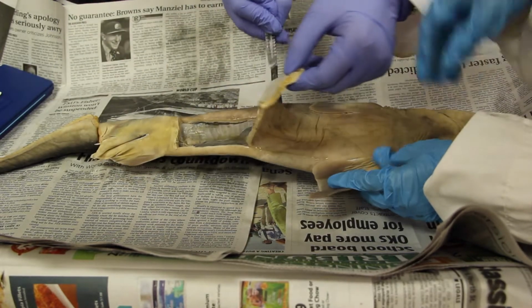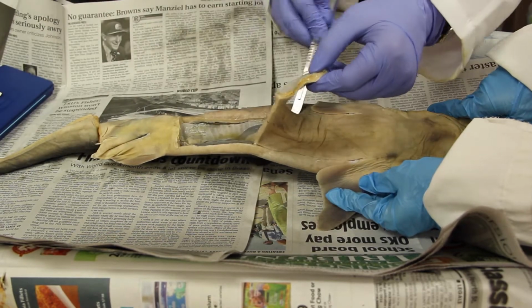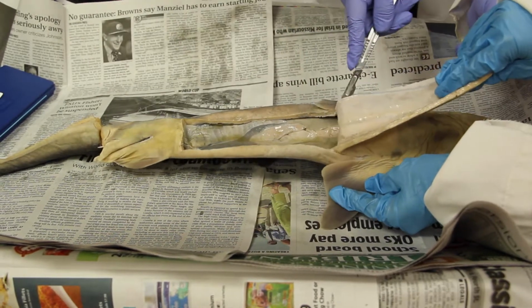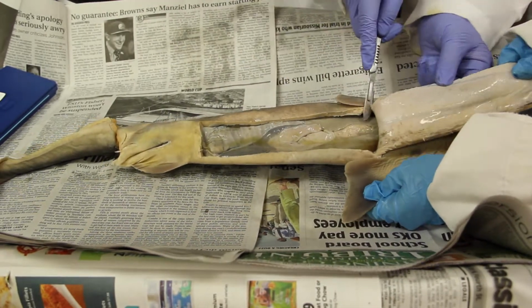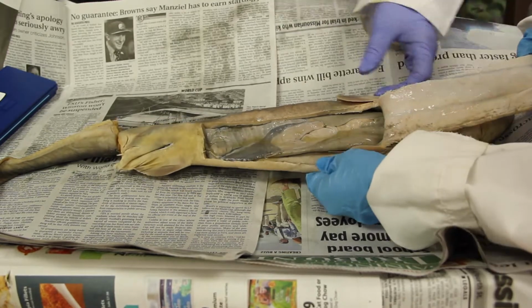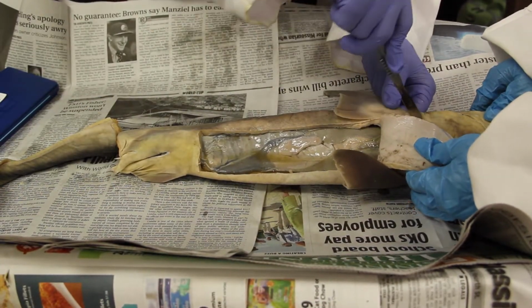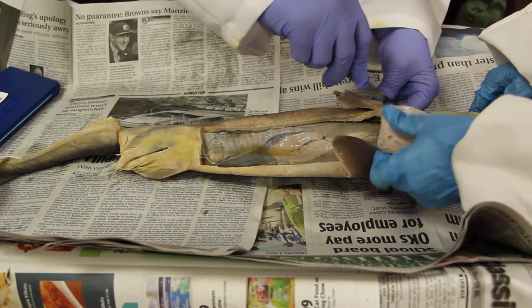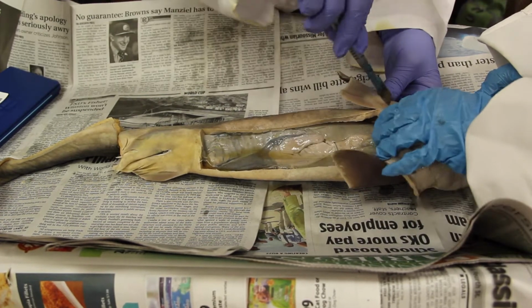And then after you cut it, just peel back its abdomen skin so you can see all of its organs on the inside. And there's the inside of the shark. Okay, well, we're going to cut a little more so we can see up to his jaw. It's a lot tougher up here by his gill slits just because it's protecting more special organs.